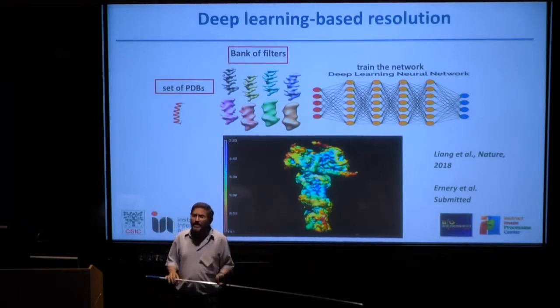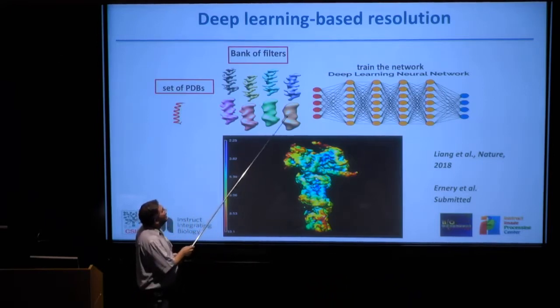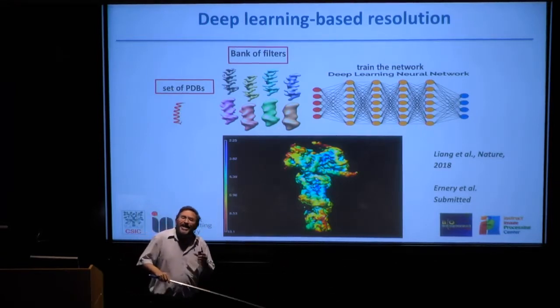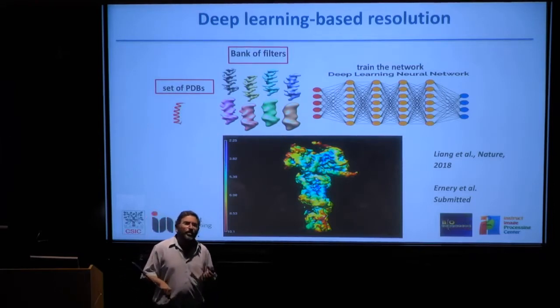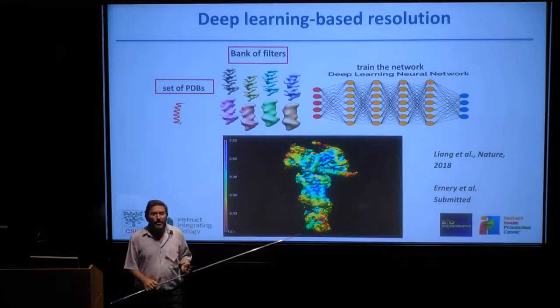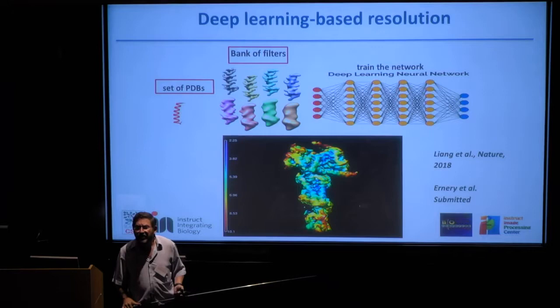And I am asking the network something very simple. When I present you a cube of something like that, please give me only one number, resolution. And that again, resolution, quality, blurring, whatever we call it, but something that really understands that it has features corresponding to the shape at that maximum frequency, or of a signal that has been filtered to that maximum frequency.